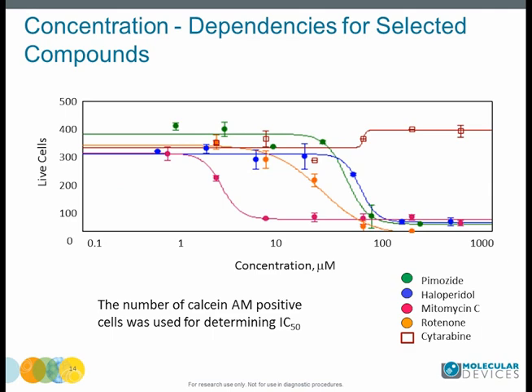The number of metabolically active calcein AM positive cells, the volume of positive cells, or the fluorescent intensity provided the greatest sensitivity. Spheroid diameter, volume, or count of dead cells changed significantly but typically did not follow 4-parametric concentration-dependent responses.